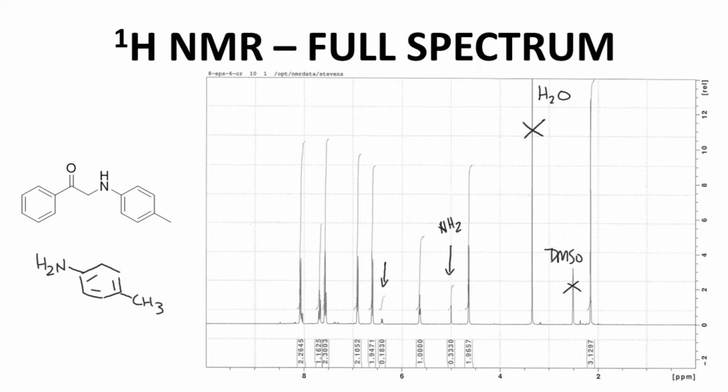The peak at about 6.4 ppm could be these two hydrogens on the aromatic ring. If you look closer, the match is not very good. Both the NH2 and these two hydrogens should have the same integration. They don't. I, however, was not looking closely. I just wanted to make sure the signals matched my expectations. It's not a very scientific way to look at data, but that's where I was coming from.